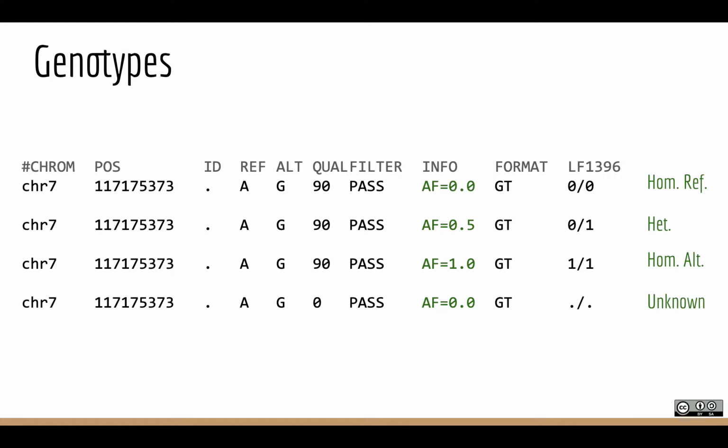So anyone with 4 or 3 or 2 or 1 or 0 would have unknown genotypes. Typically, when you run tools like GATK, you don't mess with those parameters. You just accept their defaults, and it uses the data to make those predictions. But yeah, the biggest source of unknown genotypes is just a lack of sequencing data for some individuals.